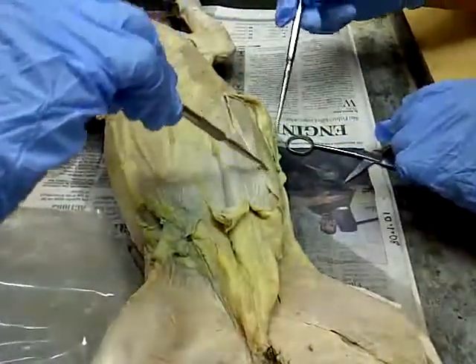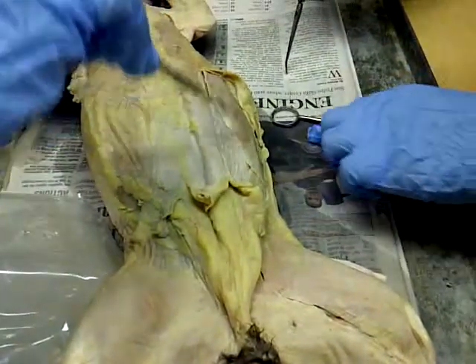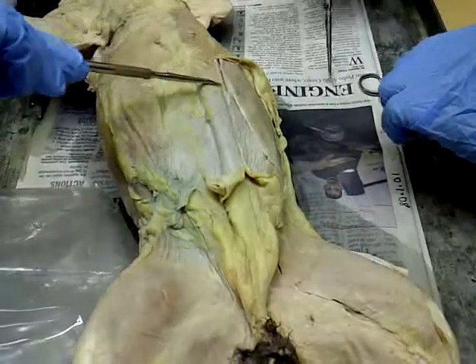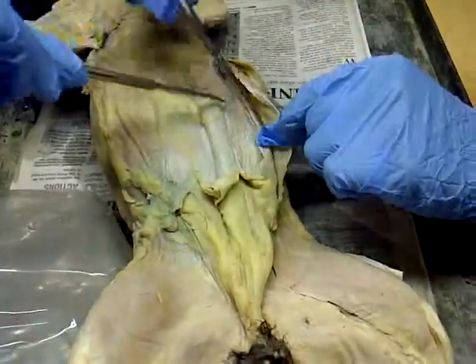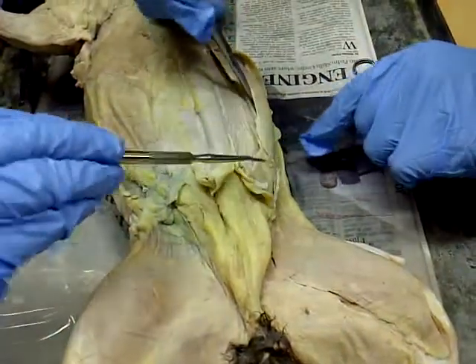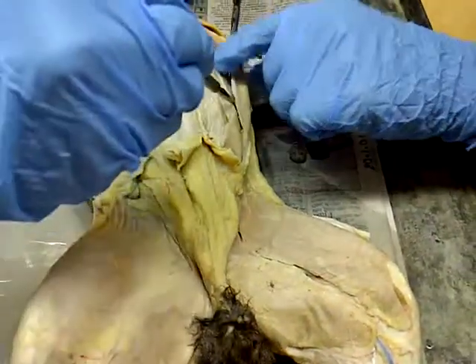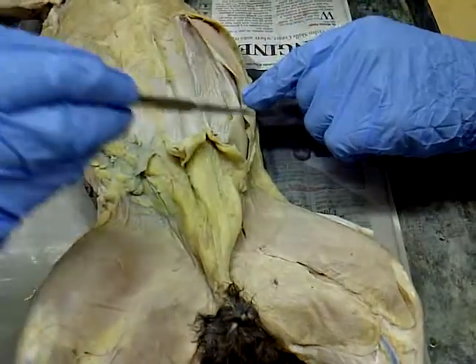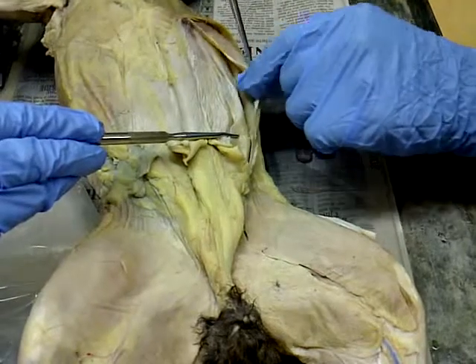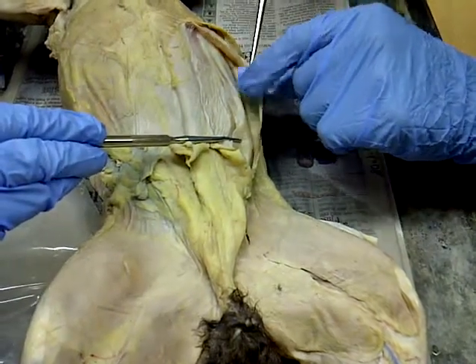See this section right here going in? That's the external oblique, and the external oblique goes in your front pocket. And then if you flip, the internal oblique: you see this section right here that's going out, the fibers going towards the back. That is the internal oblique.